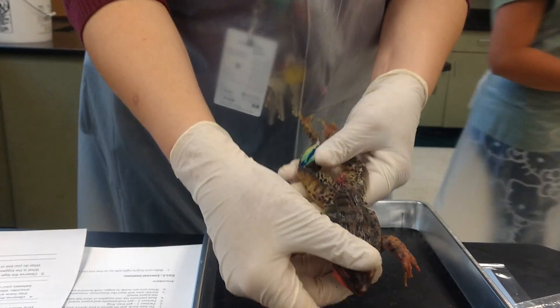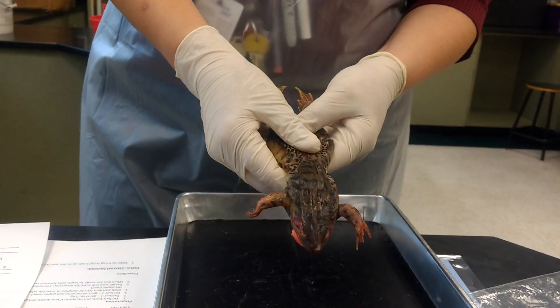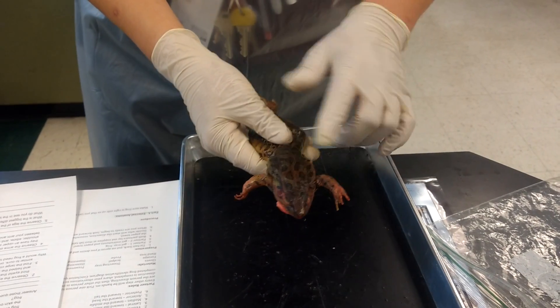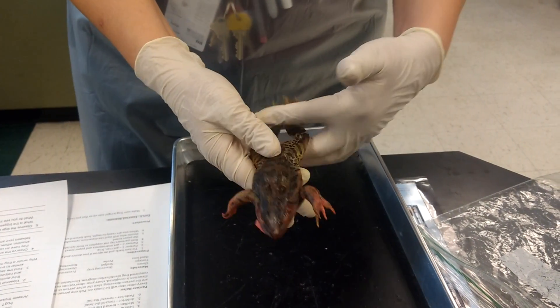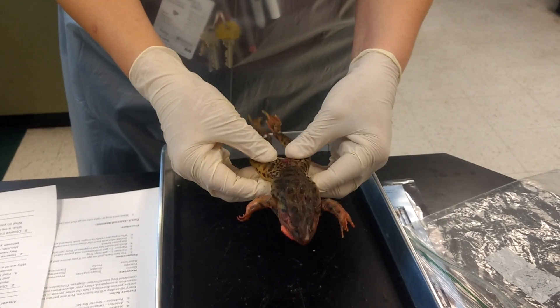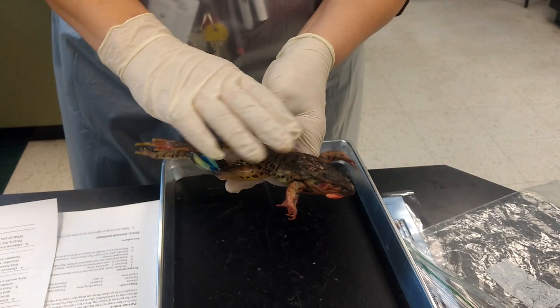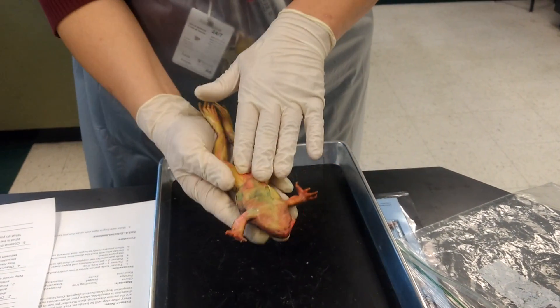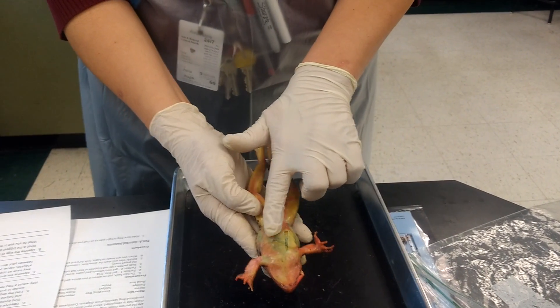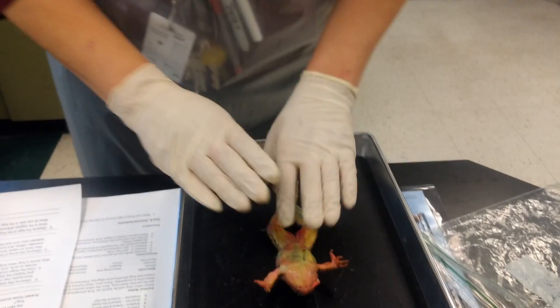Ventral, dorsal, anterior, posterior — anterior is towards the head, posterior is towards the tail. That's why we say sit down on your posterior. Dorsal is the back, like a dorsal fin on a dolphin. Ventral is towards the belly.